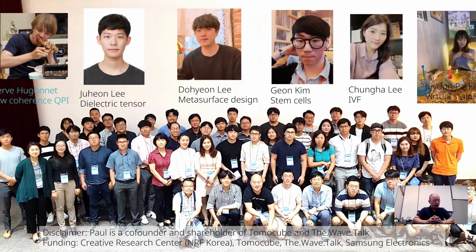So to summarize, I have introduced the principle of HCT, holotomography, which is the optical analog to X-ray CT. And it has several benefits, for example, label-free, three-dimensional high resolution, long-term measurements, and quantitativeness. And we also briefly introduced that by combining HCT and AI, we can improve image quality, and we can do segmentation, classification, and virtual staining.